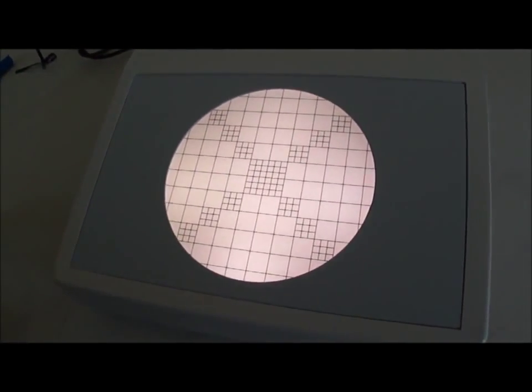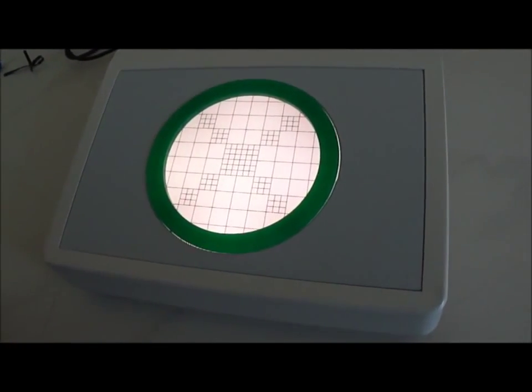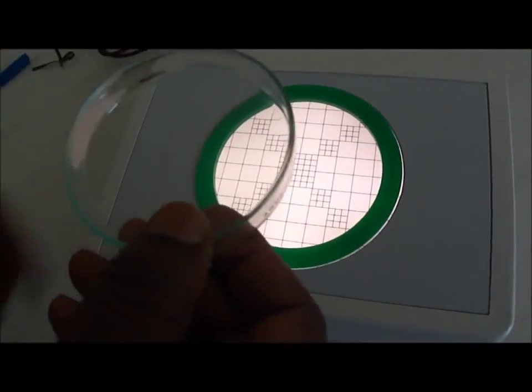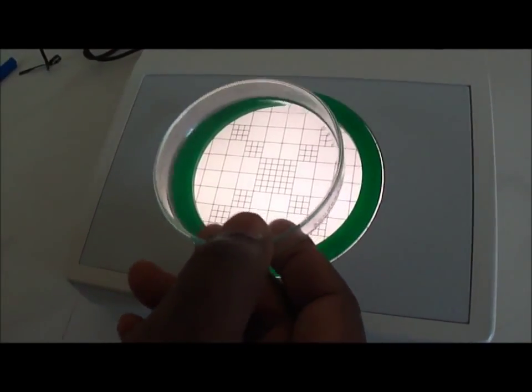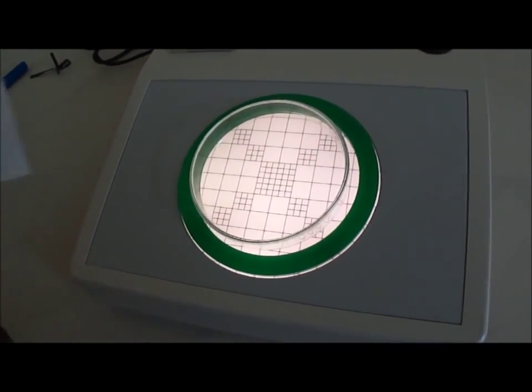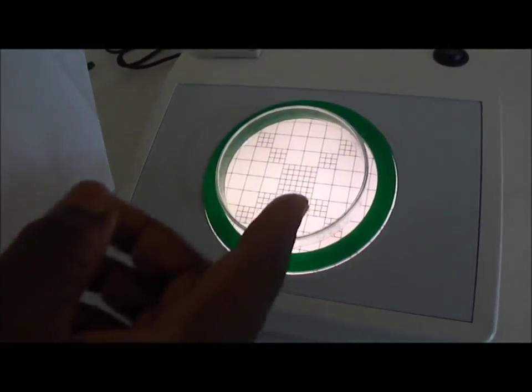You can see the central part, that's called the plate, and you have a ring that will be put inside the plate. The role of this ring is to maintain in position the petri dish that will contain your agar with the bacterial growth colonies. If you put it inside, the bacteria colonies will be on the top of your agar inside the petri dish, as you can see here.